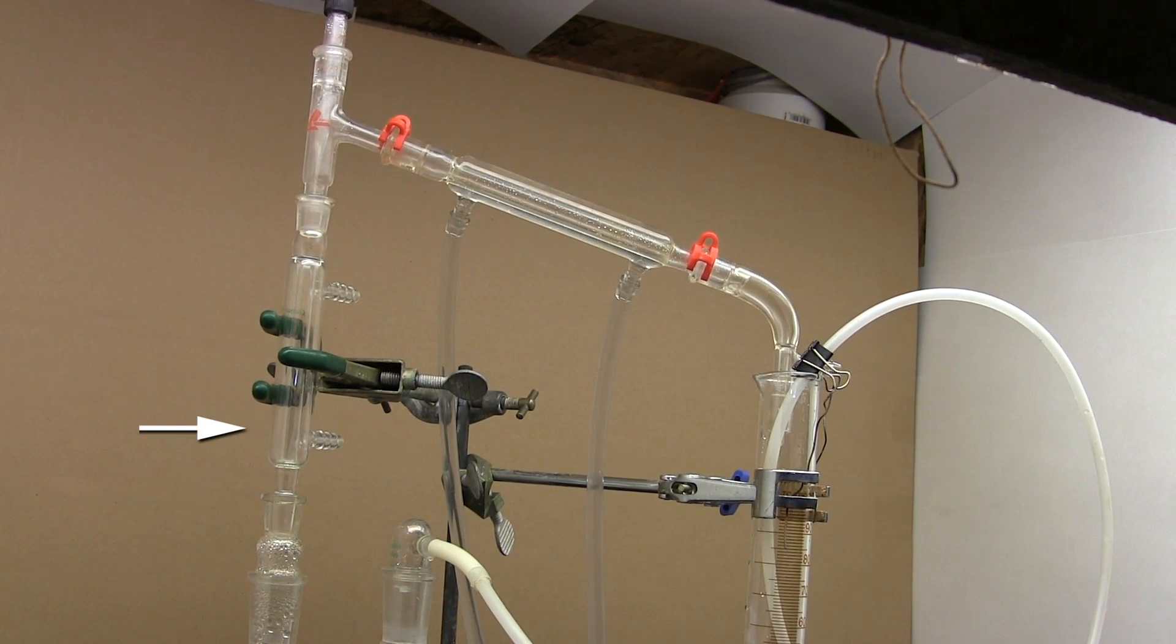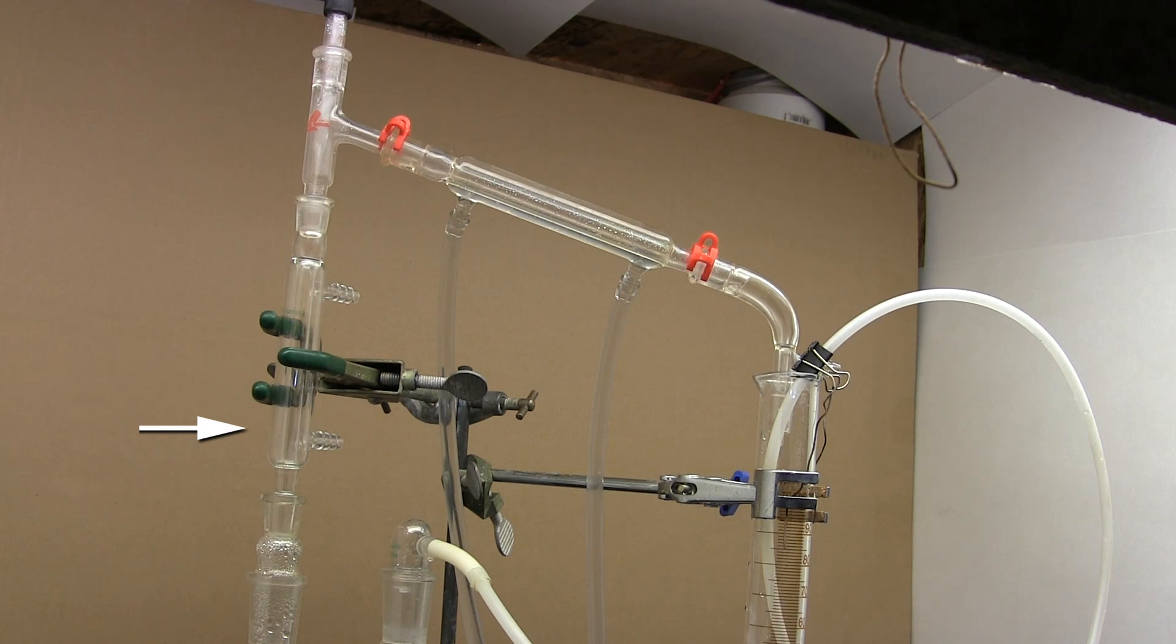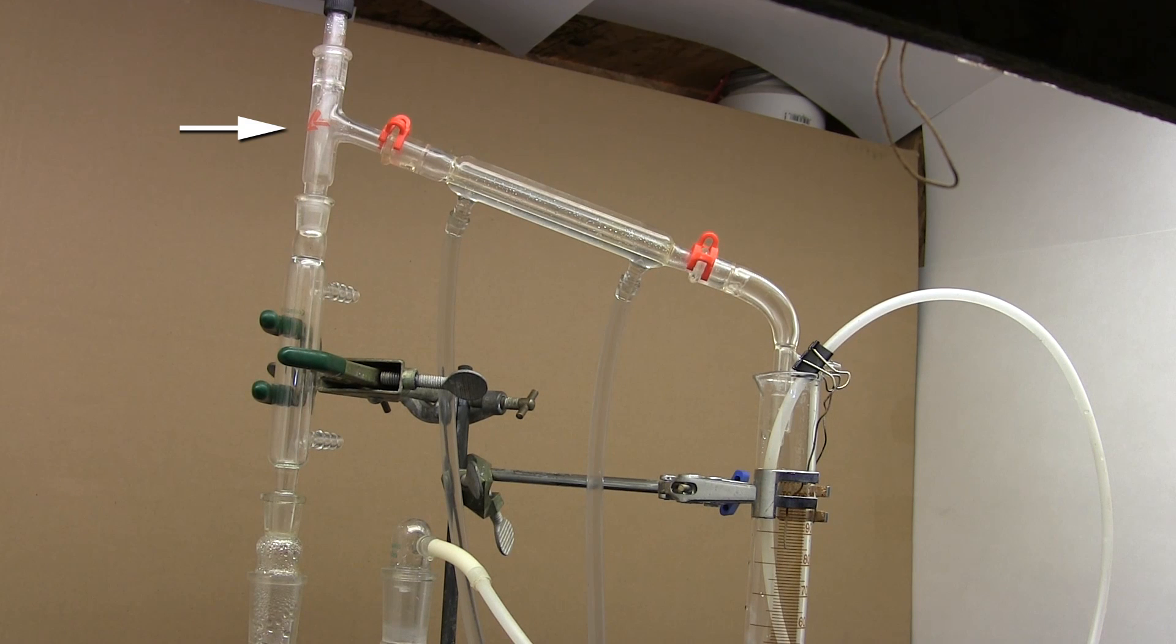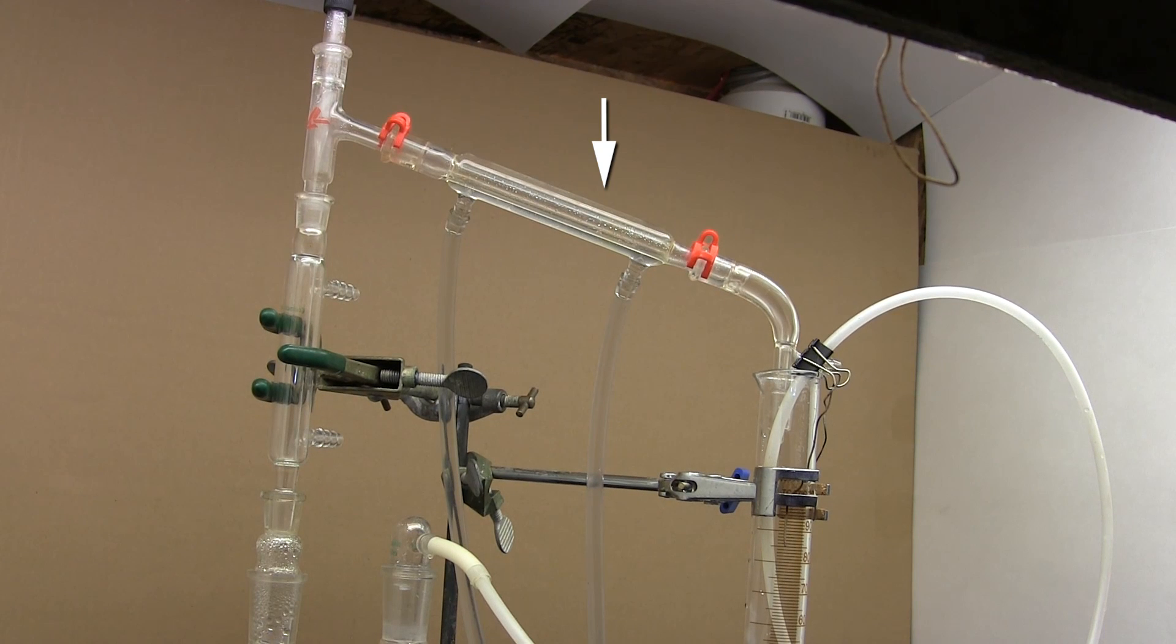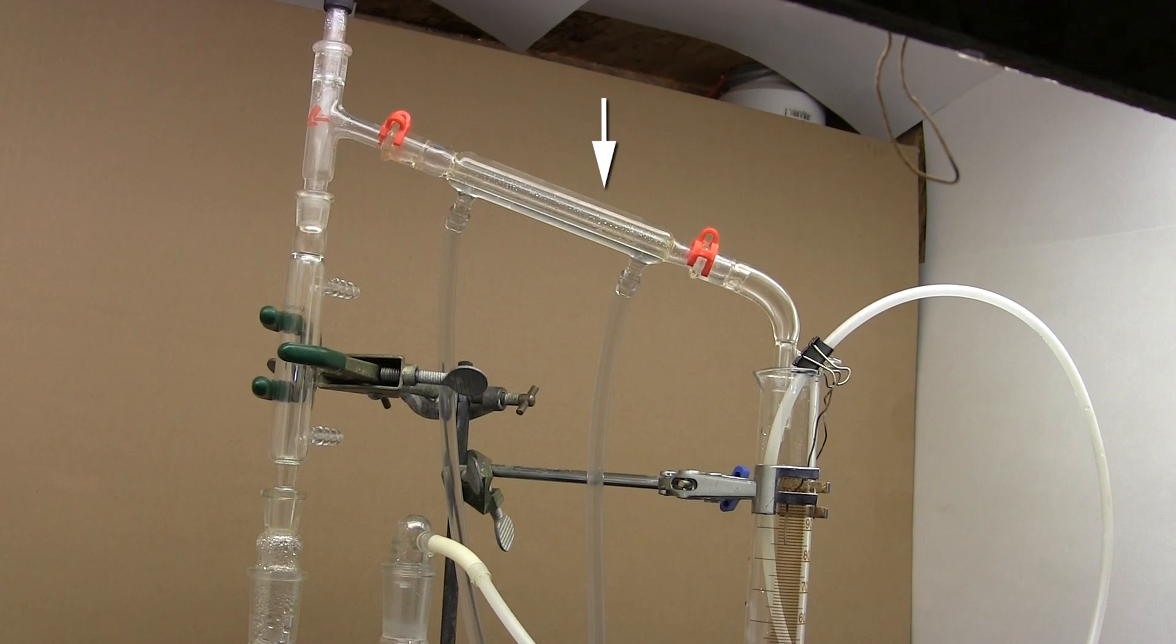Now to the Claisen adapter we have a condenser column. This is not actually being used as a condenser as you can see it's unconnected and you can use just about any column. What we want here is to increase the height of the still head up here. So you can use whatever column you want to achieve that. Now to the still head we have a properly connected condenser column that will actually be used as a condenser.